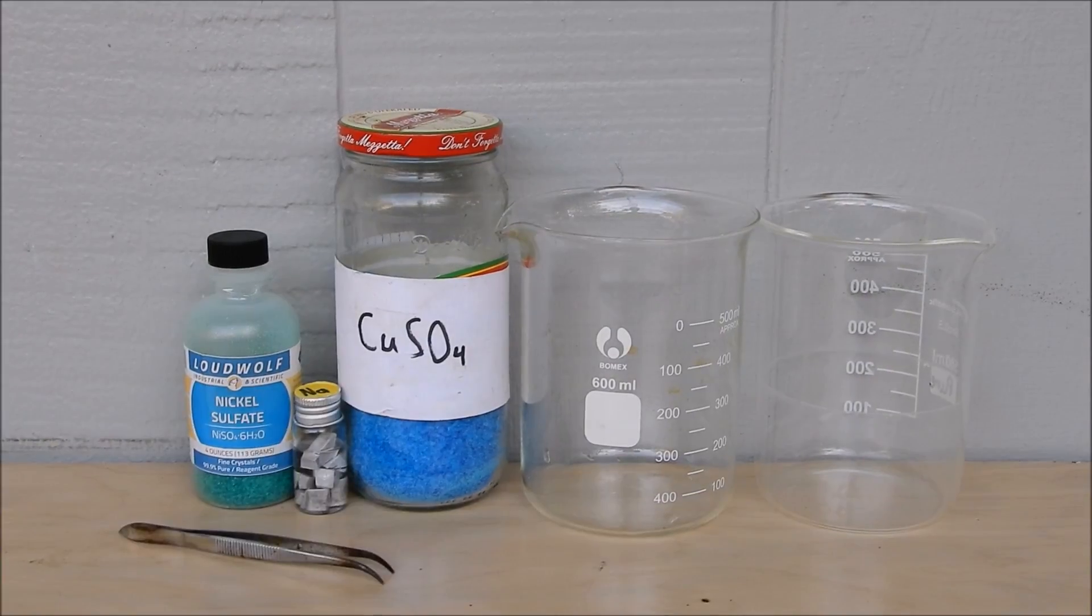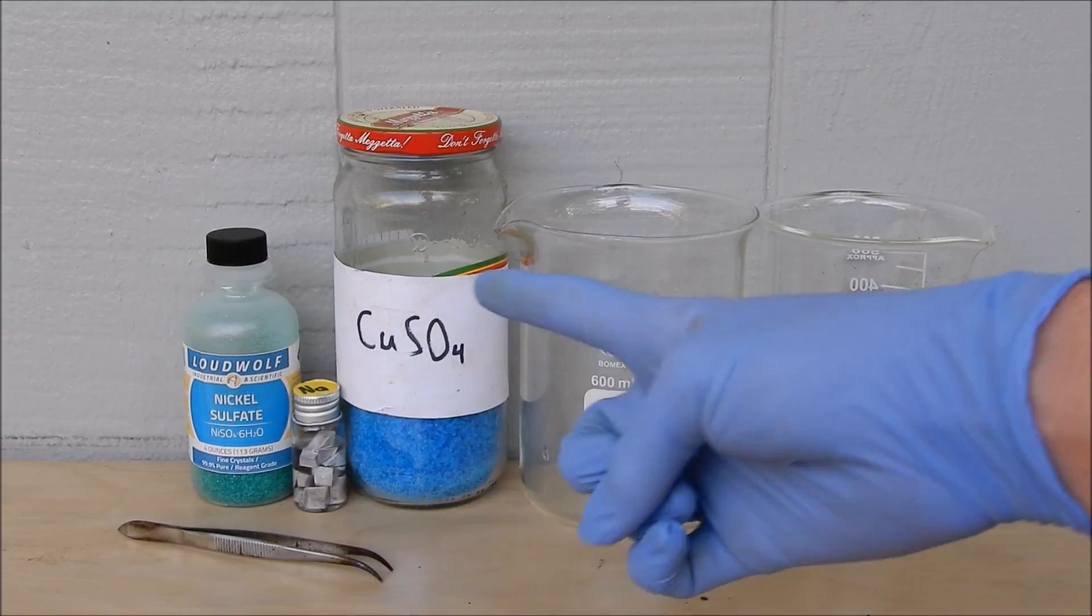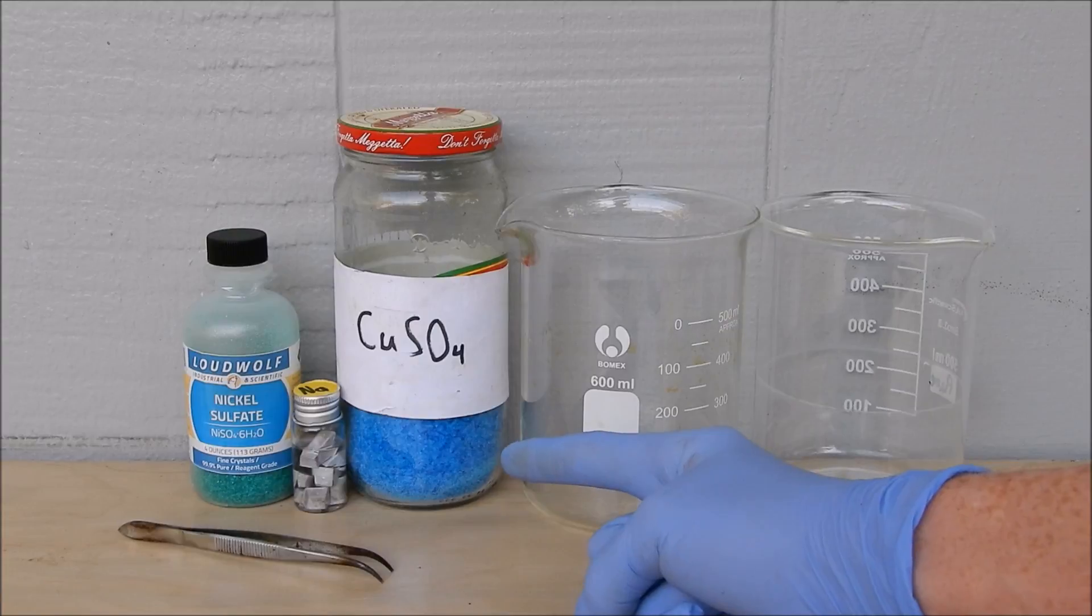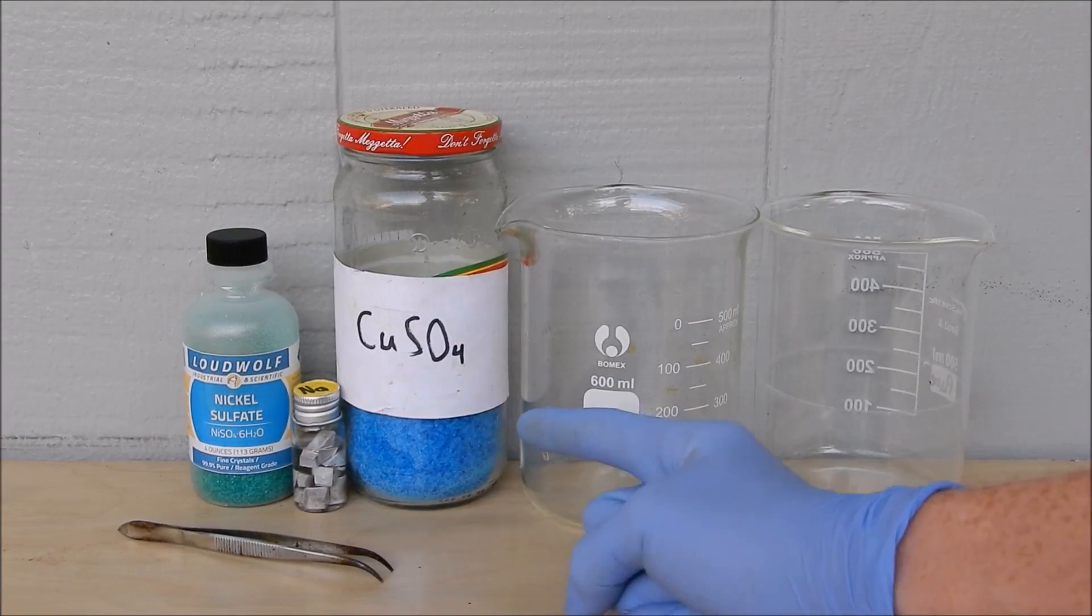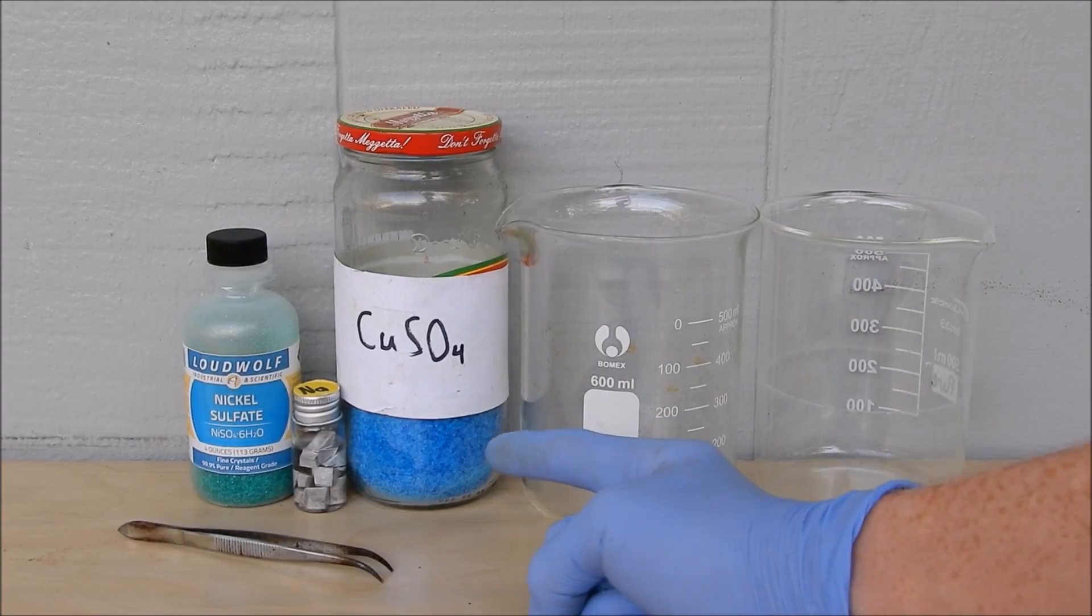Here's what we're going to need: two beakers, sodium metal, nickel sulfate, and I'm going to be using copper sulfate as a control to see if it even works with copper sulfate and sodium metal. So let's prepare our control solution: copper sulfate in water.